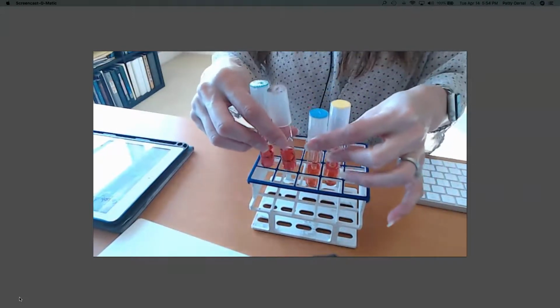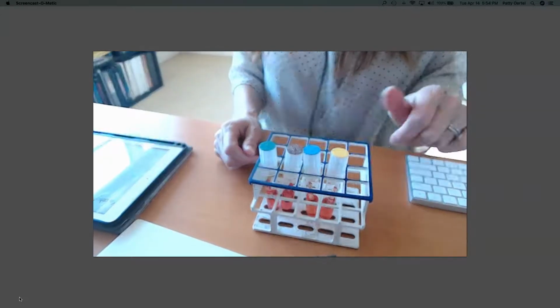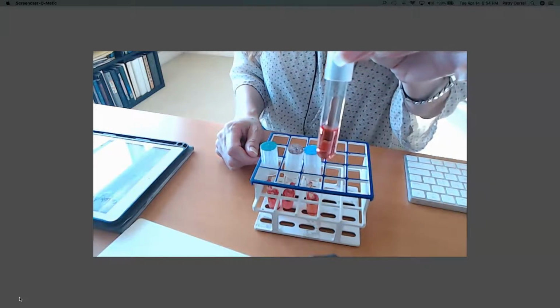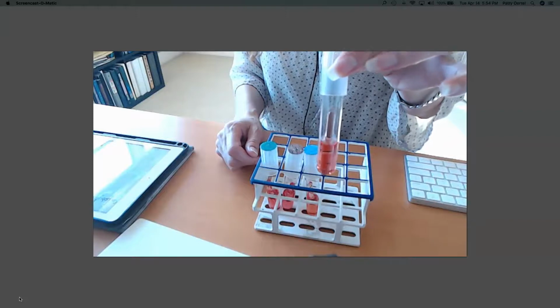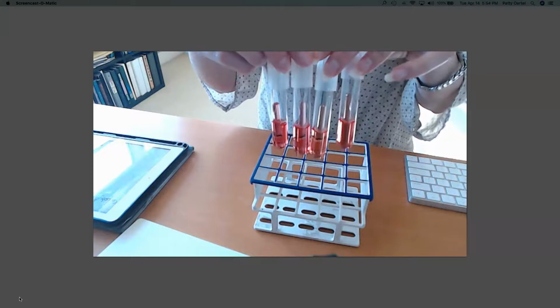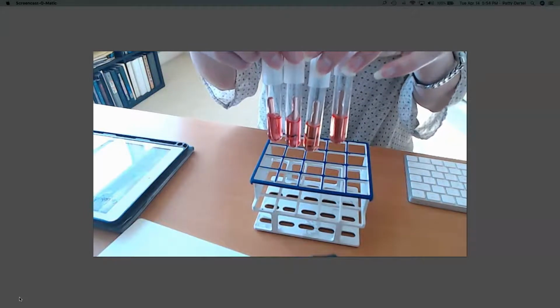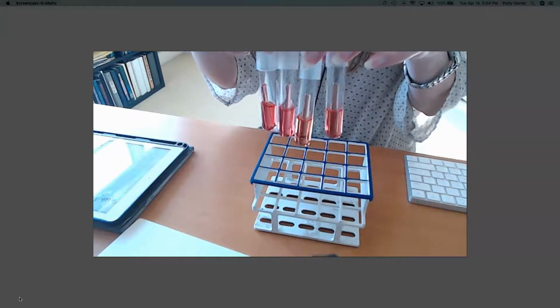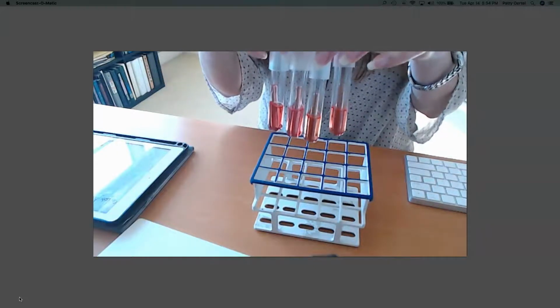What I want to show you actually is I want you to take a close look at this carbohydrate. What do you notice in all of these 4 different carbohydrates, in fact? What you notice, hopefully, is the color, for one. Yes, the color is red. We're going to talk about why it's red.